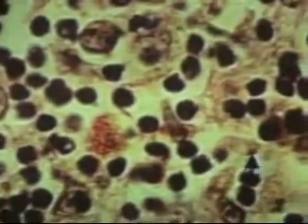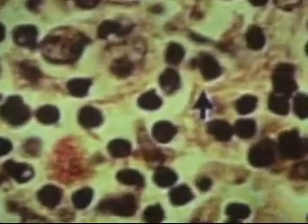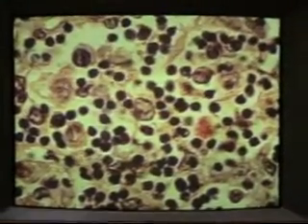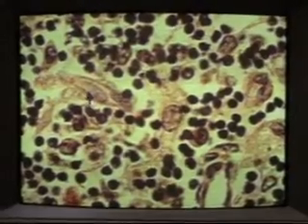If you look at these lighter cells, these are the epithelial and epithelial reticular cells. Also, those macrophages, we talked about the macrophages, that is something with lots of debris in it. If you look at this one here, again a macrophage, or this one right here, this is again a larger cell, maybe more intact with less phagocytosed material. So they are everywhere. There are lots of macrophages in here. And if you want to look at the large epithelial reticular cell, it's right here.